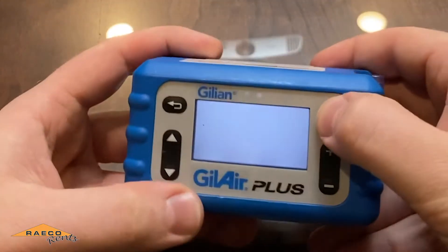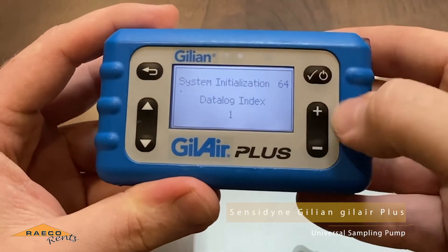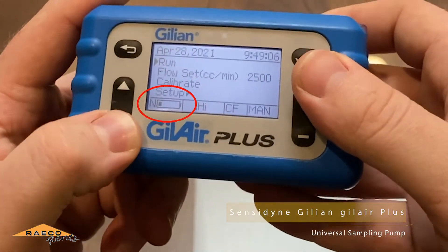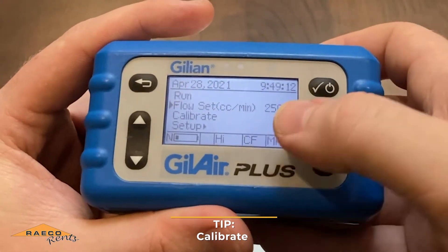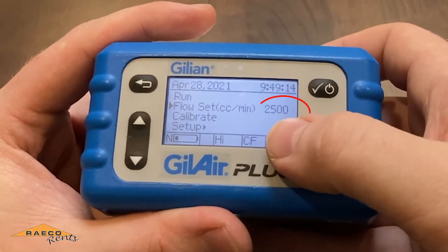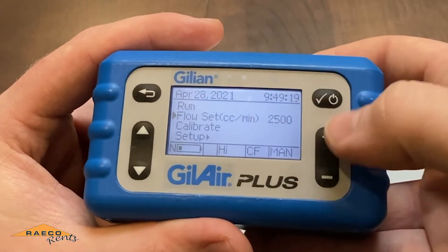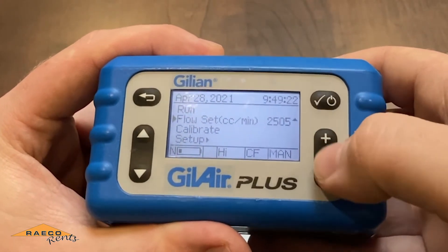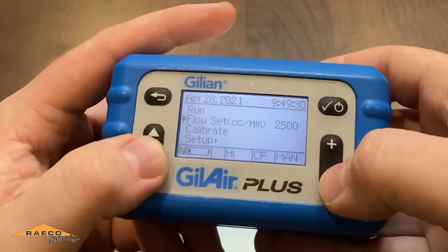Now I'll show you the GilAir Plus. Once it starts up, we've got a little battery indicator. First, you'll want to set the flow rate to what you're trying to calibrate to. In this case, we'll leave it at 2500. To do that, hit the checkmark button and then change the flow with the plus and minus buttons. We're going to leave it at 2500 and hit checkmark again to save it.